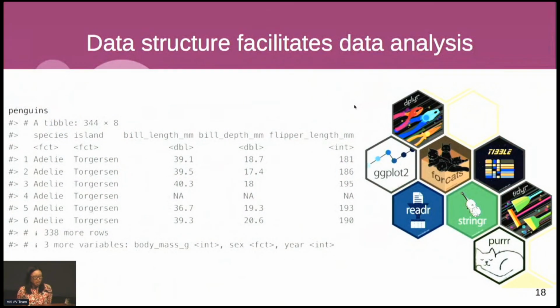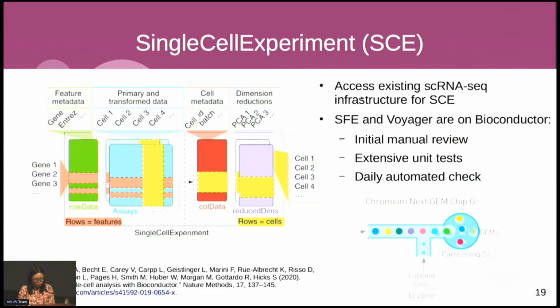I'm pretty sure a lot of you here have used tidyverse. If you've used it for long enough, you may have taken the tidy data frame for granted, but the tidy data frame is actually very instrumental to non-spatial exploratory data analysis. However, not everything is best represented by a tidy data frame.